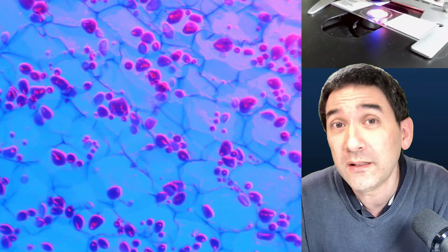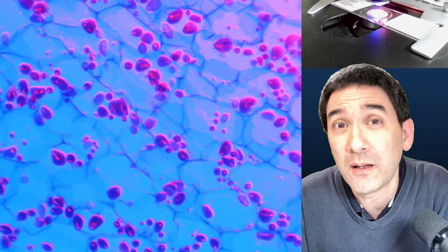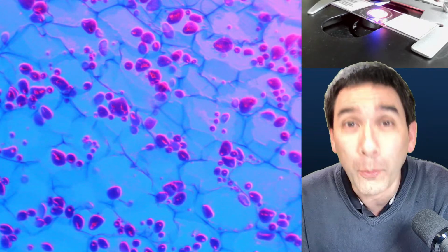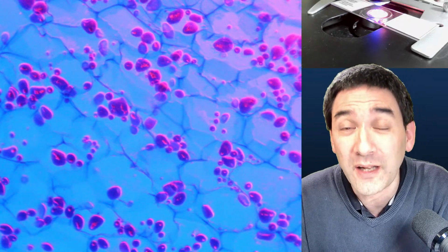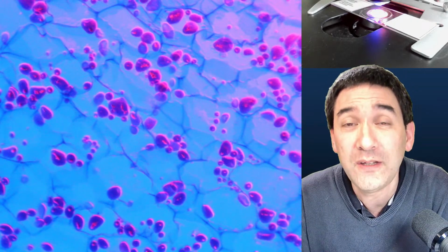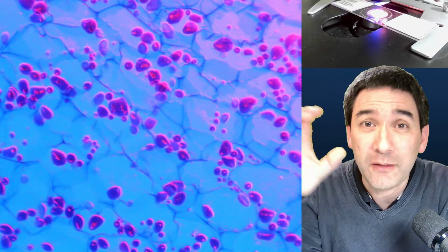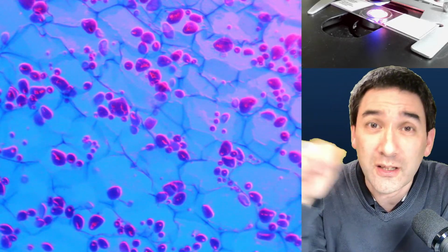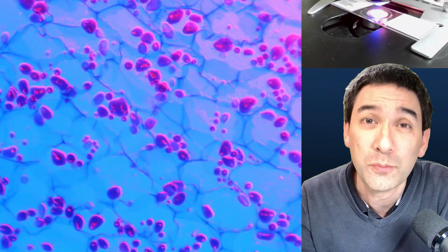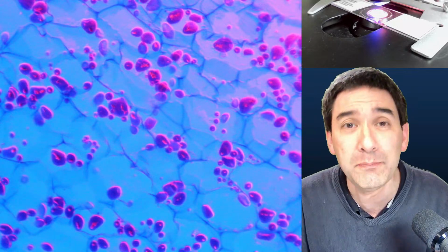I recommend that you use filters printed using a laser on overhead copying foil. This foil is relatively heat resistant, but the foil used for inkjet, where I made the filters in PowerPoint and printed them on inkjet, was not heat resistant, so it started to become soft and melt a little bit. So it might be an issue.